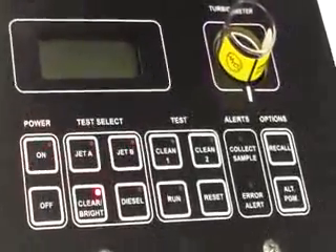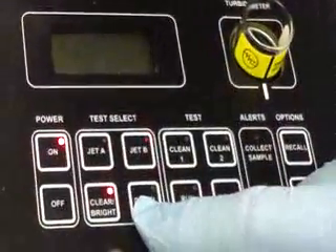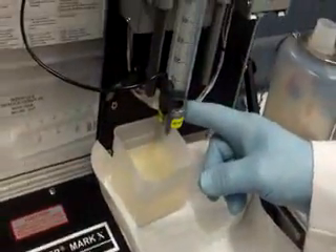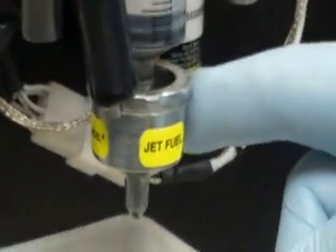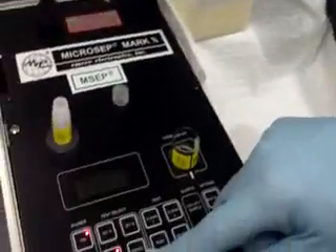We also do a Jet B test, clear and bright, and a diesel test. We also make an alumicell that will do a jet fuel test with light surfactants in it — it's called an M cell. For the diesel test, you will have to buy a diesel cell.